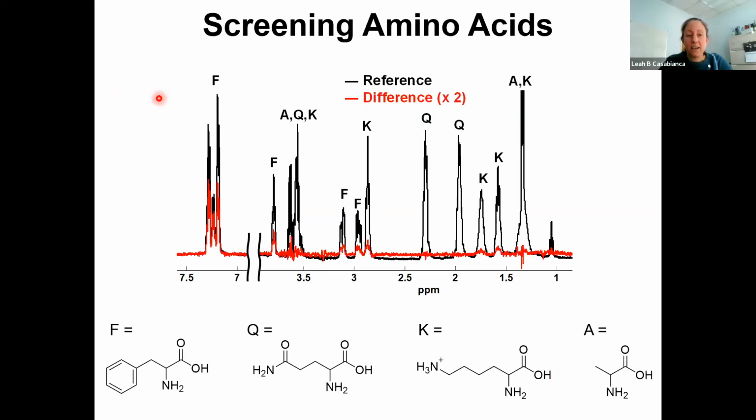We looked at different amino acids as a model for molecules with different functional groups, again binding to polystyrene nanoparticles with a negative charge. We saw that positively charged amino acids like lysine had an observable STD effect. What was kind of interesting was that the aromatic amino acids showed a very appreciable STD effect. So this tells us about our nanoparticle surfaces, in fact.